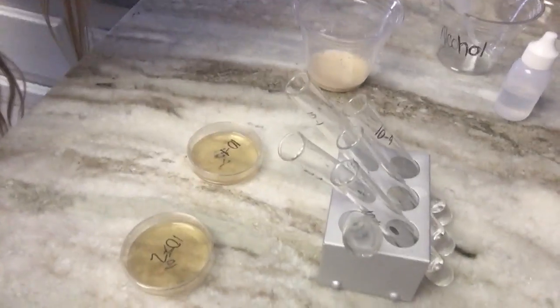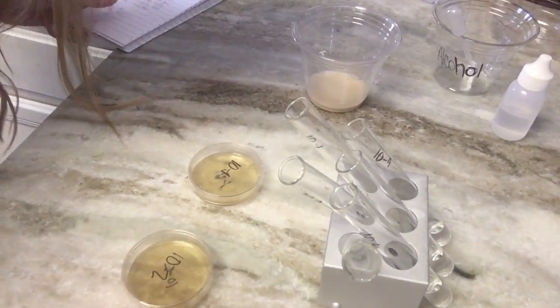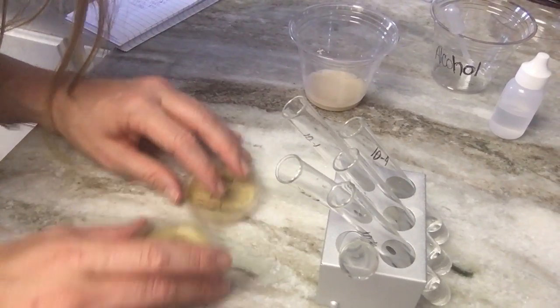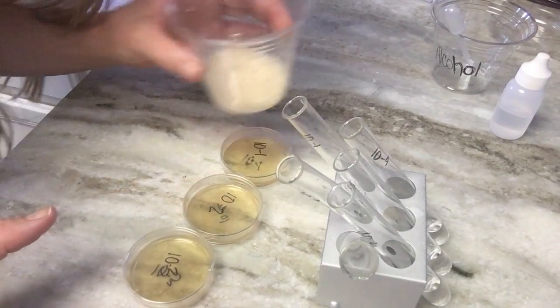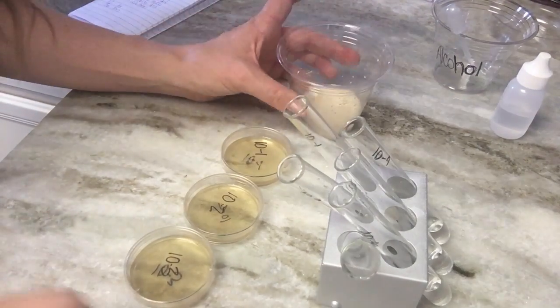It took some time. So let me put my mask on, and I'm going to face the camera down so you can see what I was doing. And there's our agar plates. So here's a few of our agar plates. Pull them over so you can see them. And here's our test tubes. I had my yeast, which we no longer need.